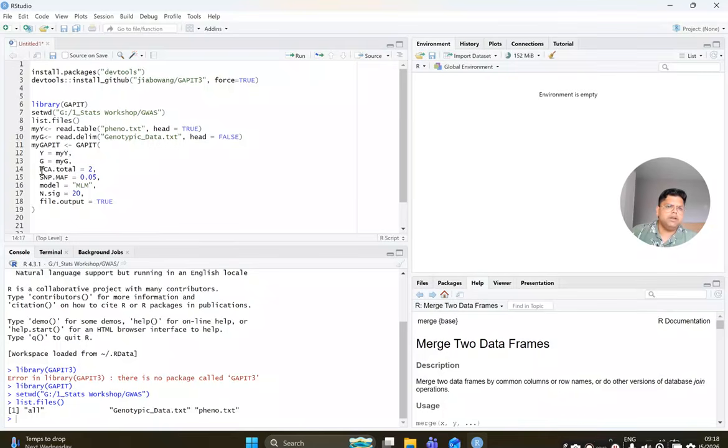And the PCA, principal component analysis, this is considered for population stratification. I already did population stratification by population structure, and I found two spikes, not three, two peaks, which suggests that in delta K statistics, two peaks suggest that there are two population structures. I will also show, when I get the PCA figure from this analysis, how the two populations are clustering together.